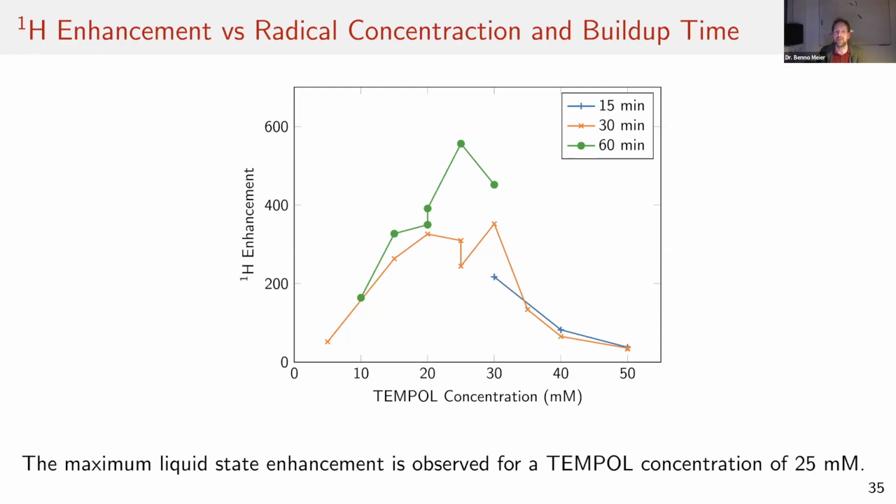an avenue to explore. But it's not so trivial to increase the field really everywhere. Of course, we also have a permanent magnet that you can put somewhere. I think maybe there's some work in the field by Andrea Capozzi and others to put permanent magnets also into the superconducting magnets, because that's what you need to do. It's already inside the superconducting magnets that the field drops to very low values, and that's where you need to put your magnets.